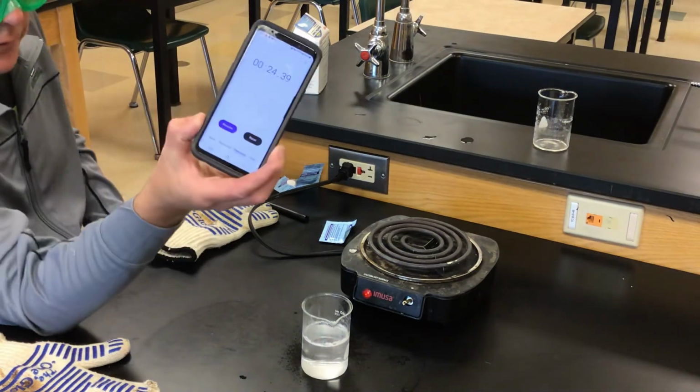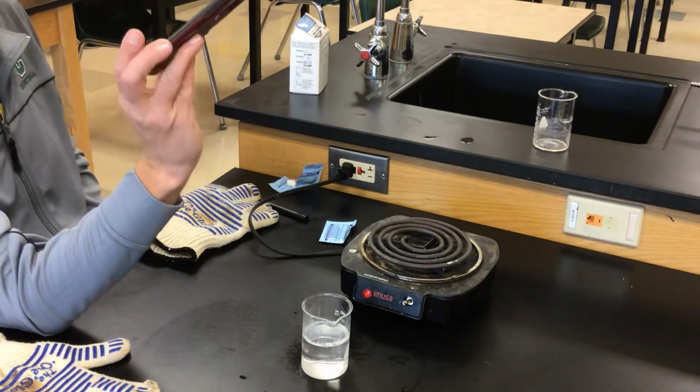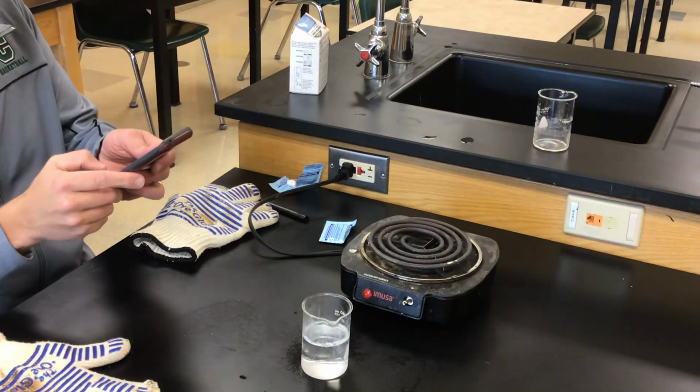Okay, I turned that off at 24.39. I don't remember what the last one was, but I think it's pretty close. Okay, so that's our first set of data.